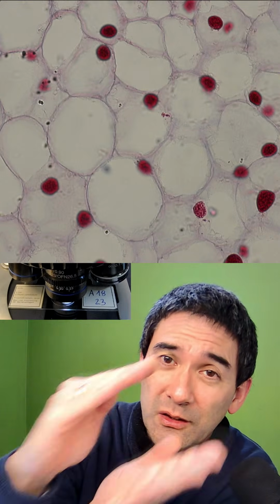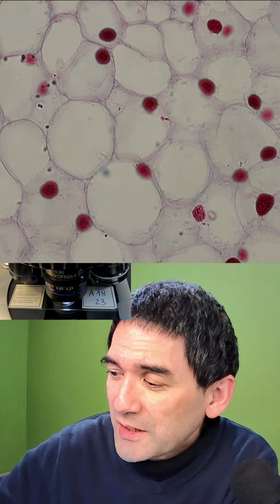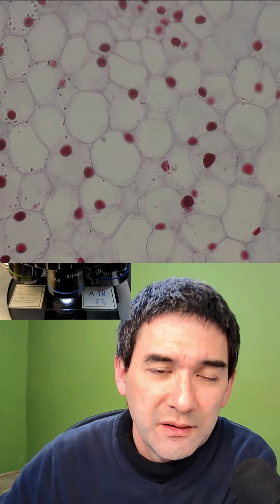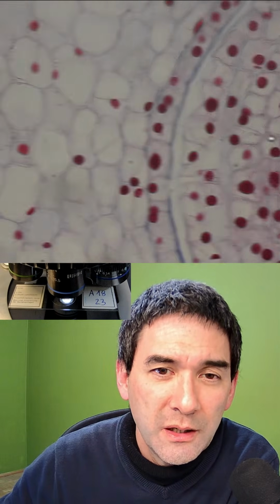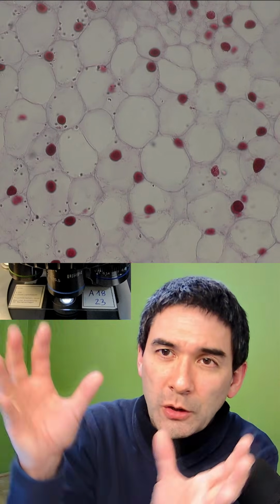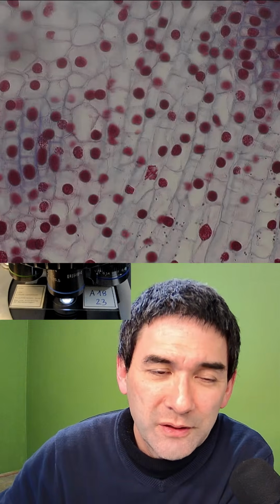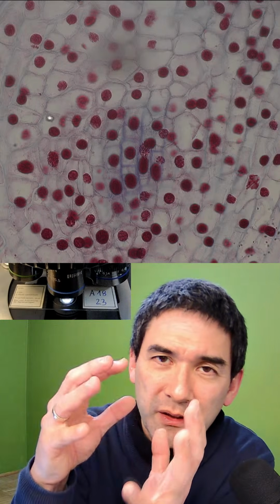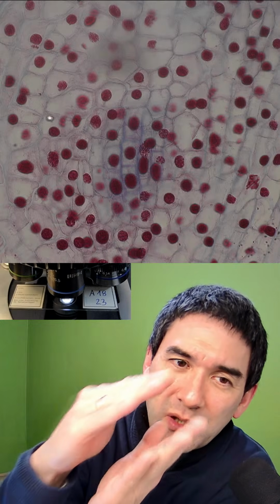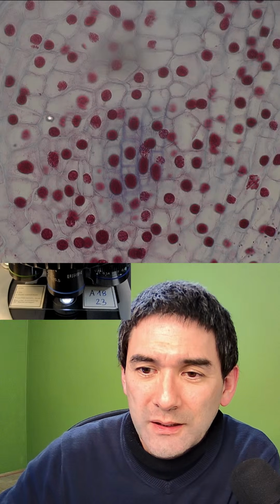So this means the nucleus, which was above or below, was cut away. This also explains why especially the larger cells, like the ones over here, seem to be missing a nucleus more often, because they're simply larger. The chance of the nucleus being cut away is much higher. And the smaller cells over here are so small that the nucleus is still very much in the center, and therefore when you cut it, you don't cut it away so easily.